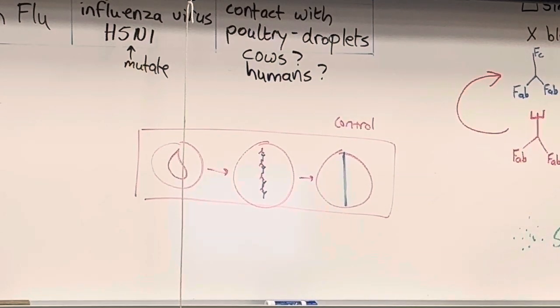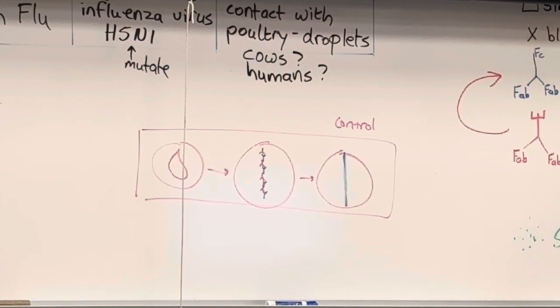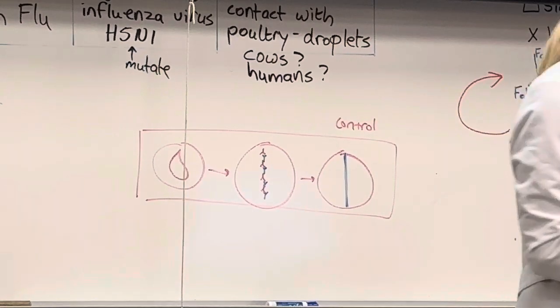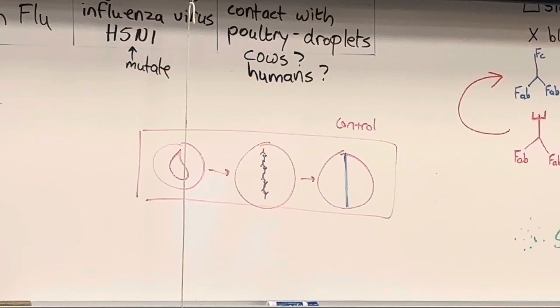Yeah. With the serotyping, it has the antigen on it when we're testing our antibodies. So they all work a little bit differently, and I don't want to make it one narrow way because it depends on which one you do. They have ones for all kinds of things, like Lyme disease, and ones for IgM and IgG to tell how long the duration is. So it could be either or.